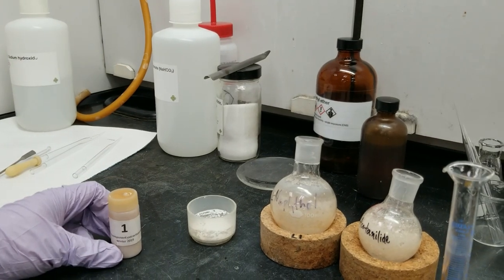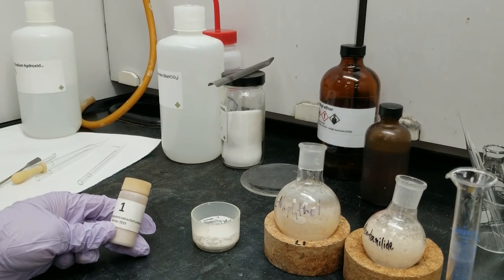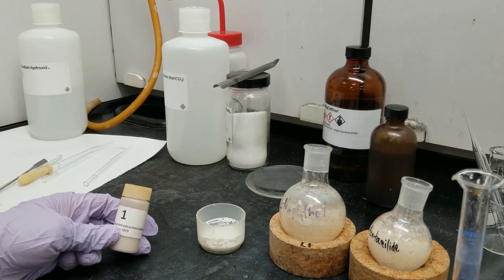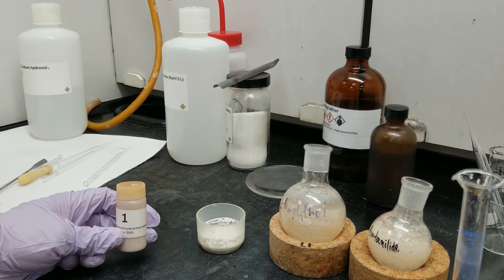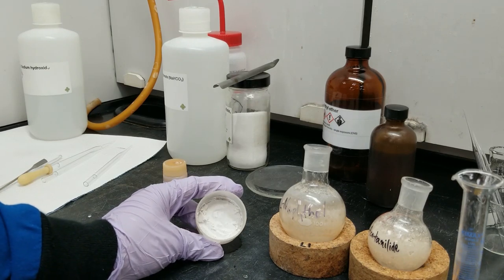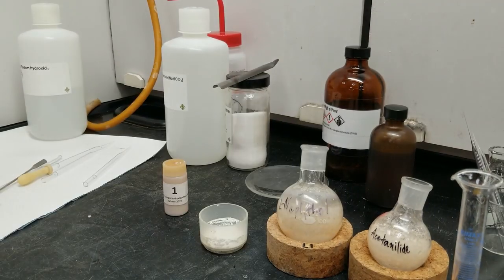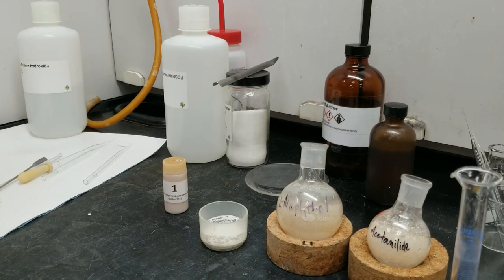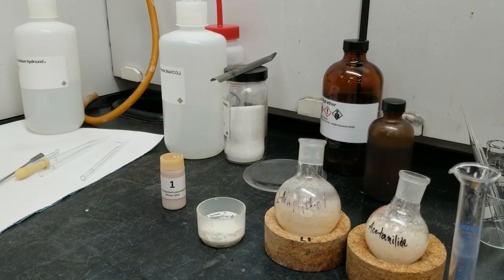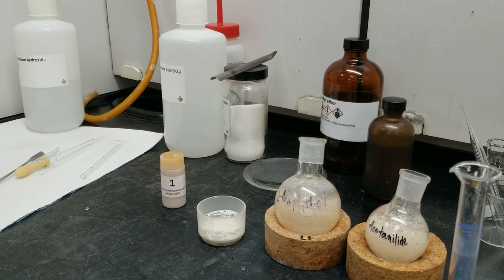In closing, I would like to show you that we started off with this three-component solid mixture, which had acetanilide as one component, 2-naphthol as the other, and 3-chlorobenzoic acid. By performing this lab, we are able to isolate 3-chlorobenzoic acid, 2-naphthol, and acetanilide in separate containers. Now we will perform melting point experiments with each of the solids in order to comment on their purity, and we will provide that to you as data.